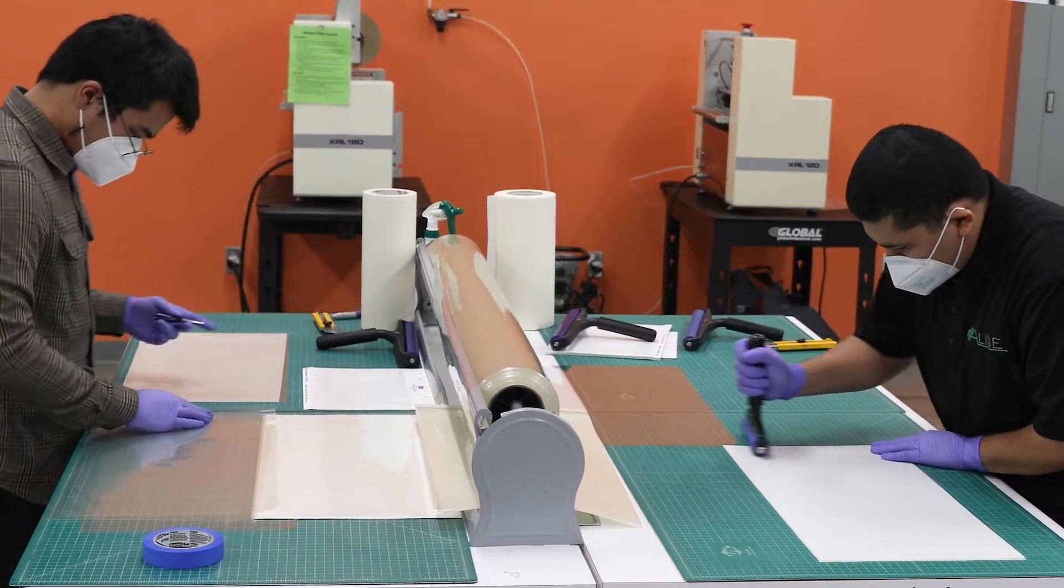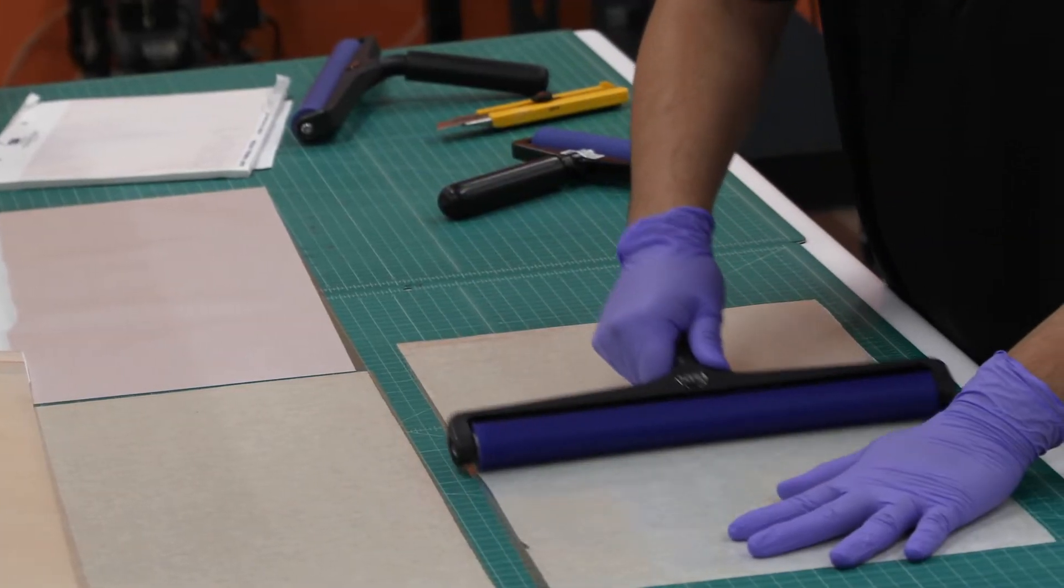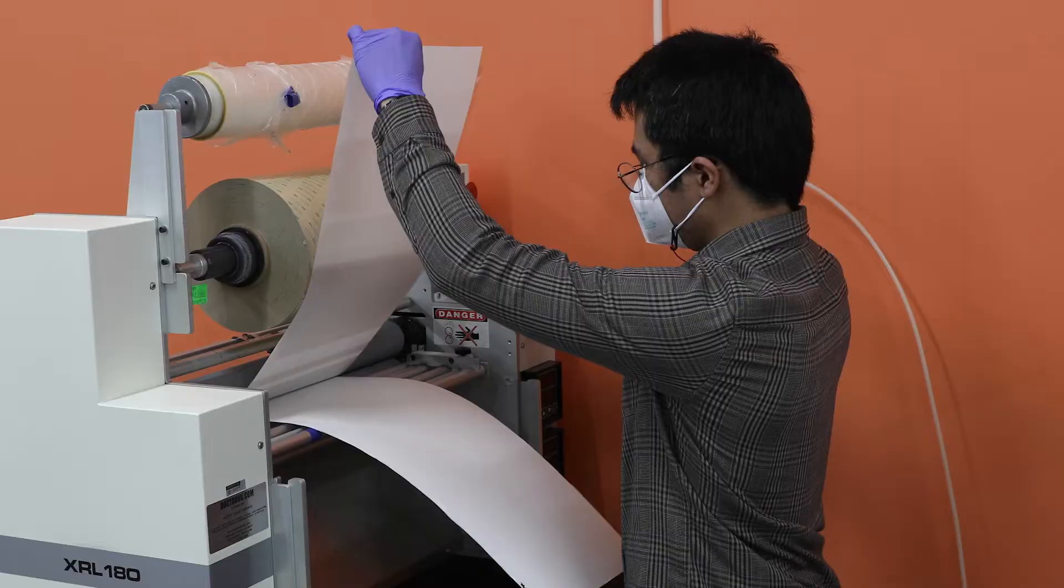Typically, microfluidic prototyping shops are limited by a 4-inch diameter wafer. We have batch sizes that are about 15 times larger than that, so right off the bat, we're able to produce larger quantities quicker and more reliably.